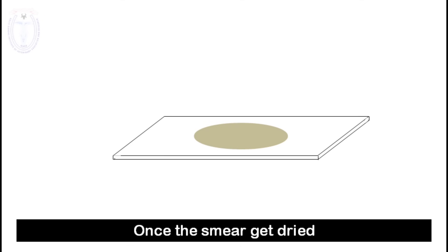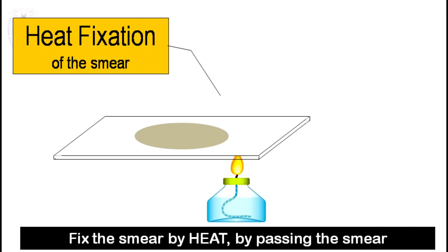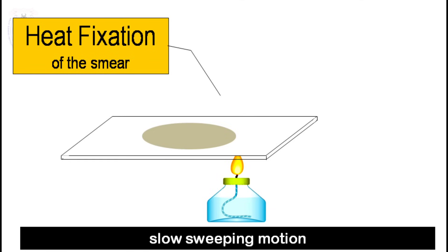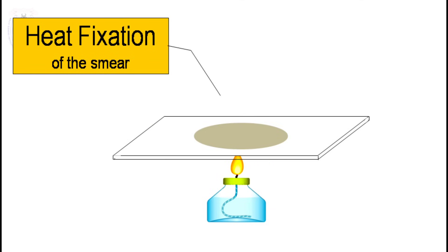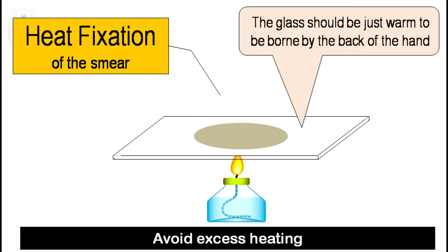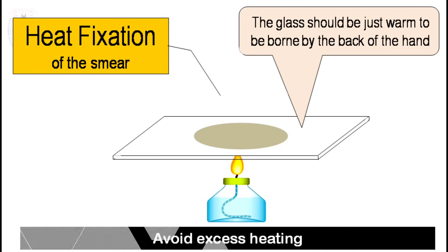Once the smear is dried, fix the smear by heat by passing it through the top portion of the flame two to three times with a slow sweeping motion. This is called heat fixation of the smear. Never heat the smear side; avoid excess heating. The glass should be just warm enough to be borne by the back of the hand.